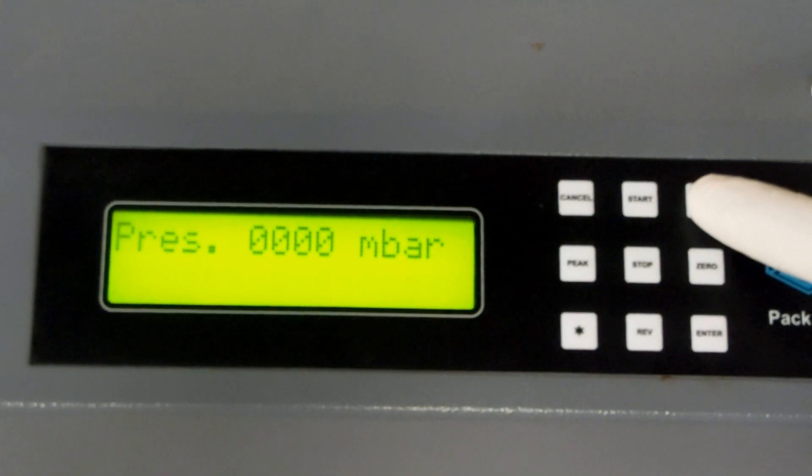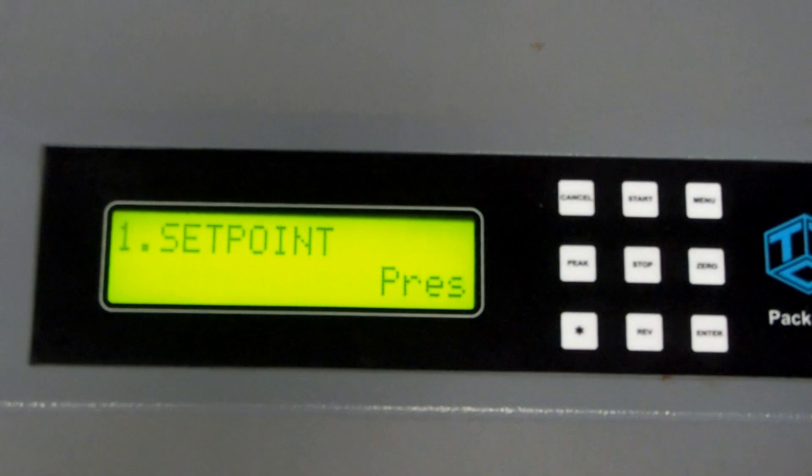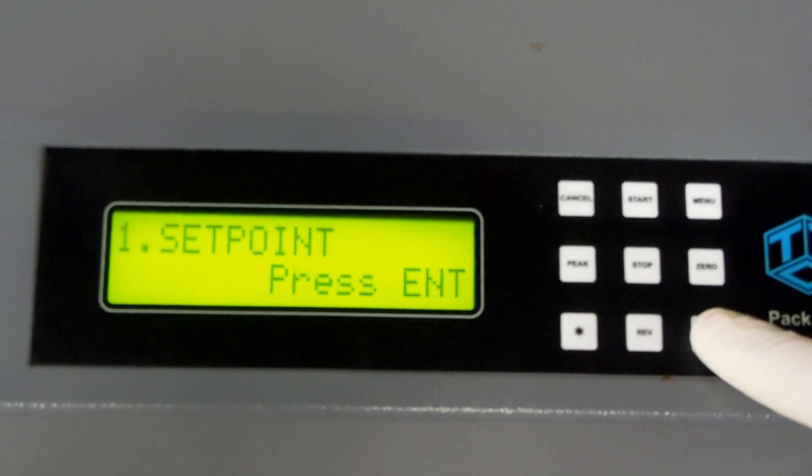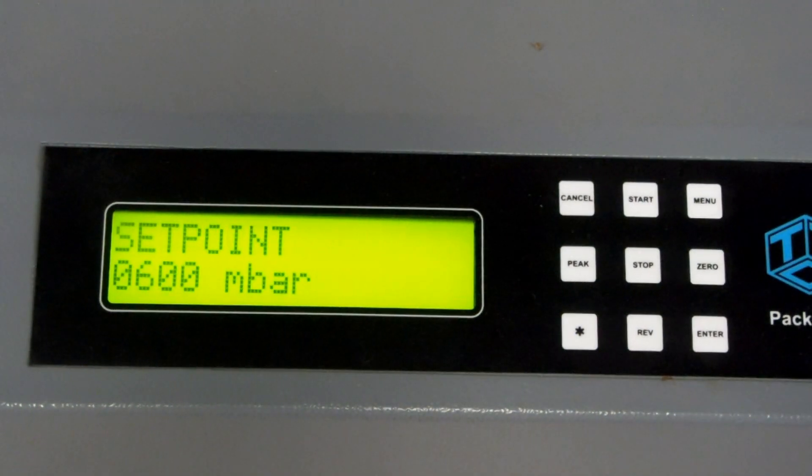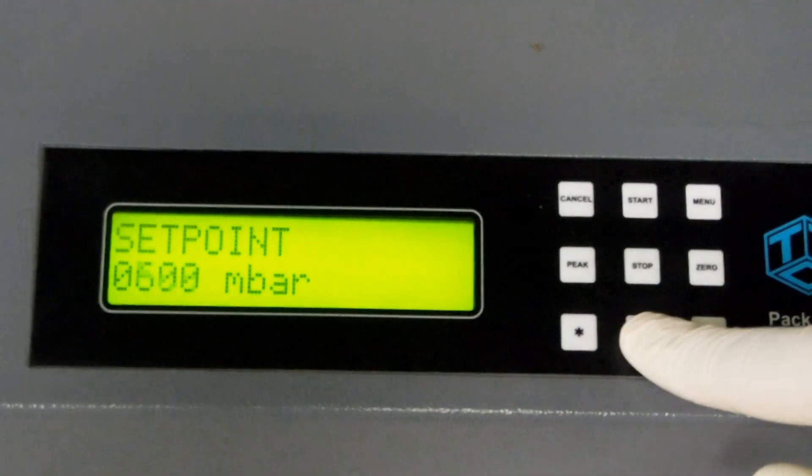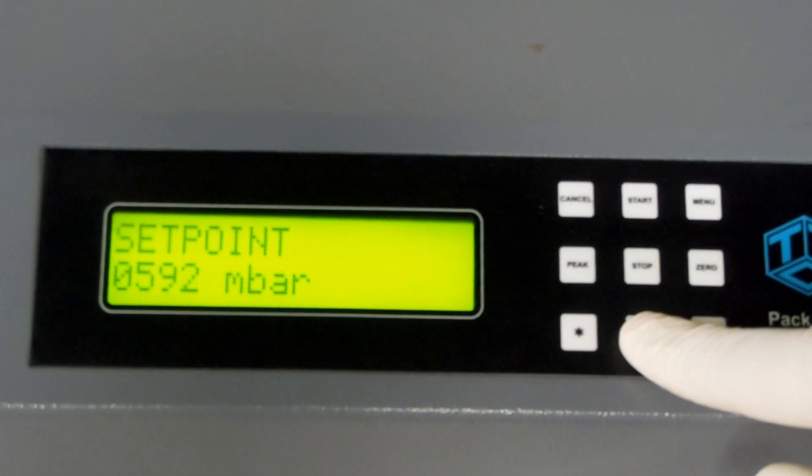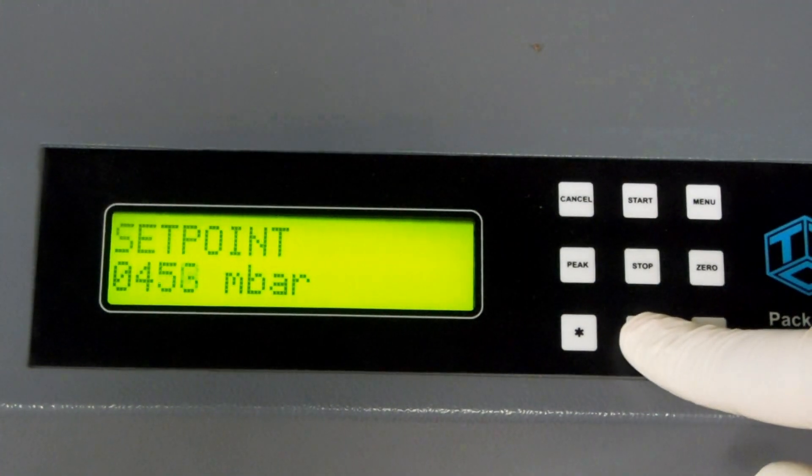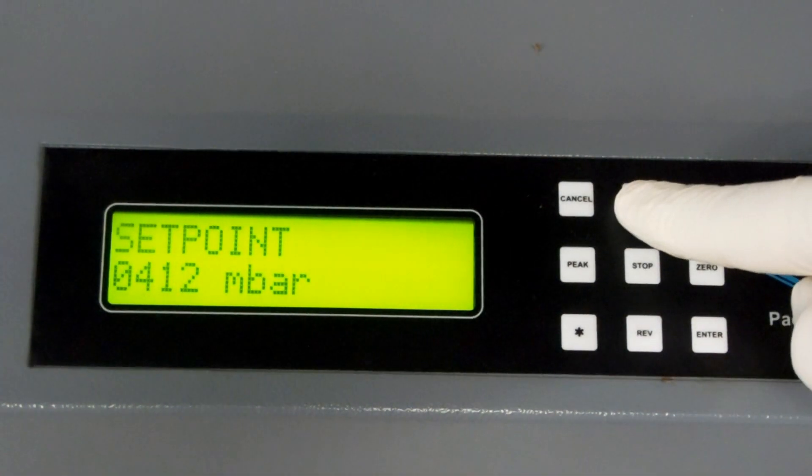Press menu, now press enter. This is the current vacuum setpoint. You can change the current setting by using the start and reverse keys to increase and decrease the value.